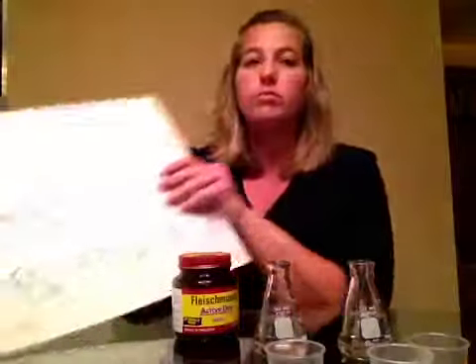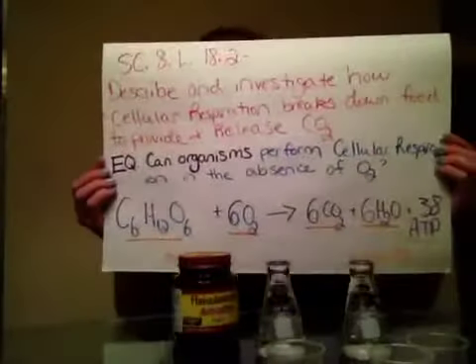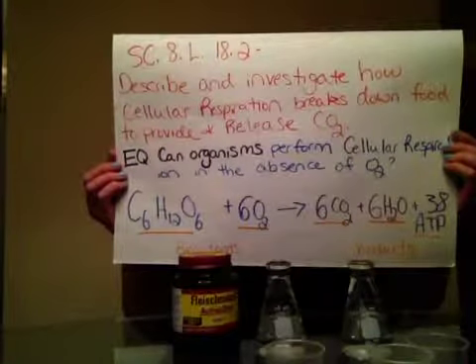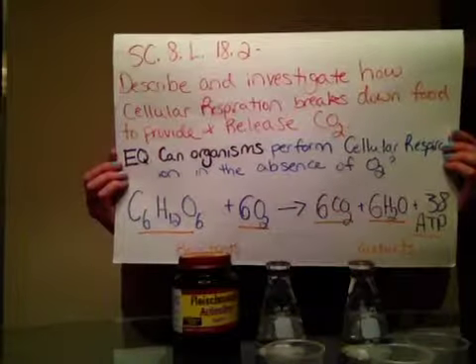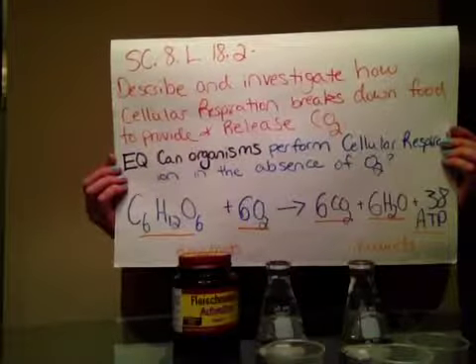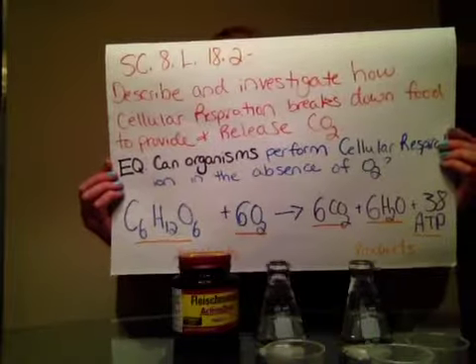Today I'm going to show you a short demo on cellular respiration. The standard is describe and investigate how cellular respiration breaks down food to provide energy and release CO2. The essential question, can organisms perform cellular respiration in the absence of oxygen?